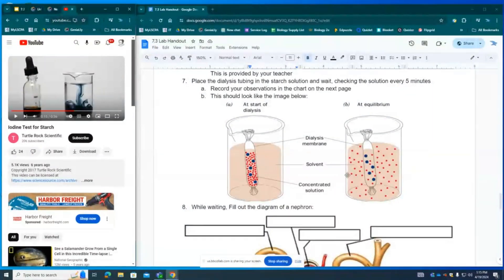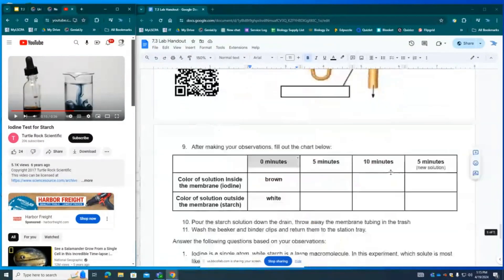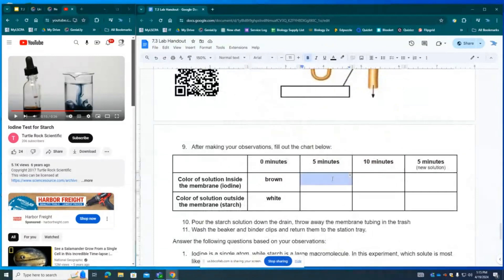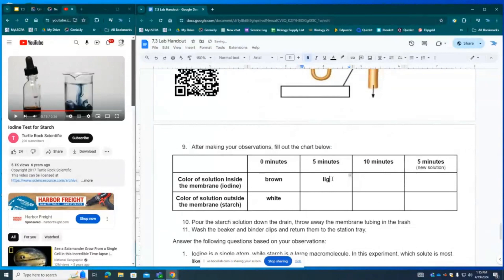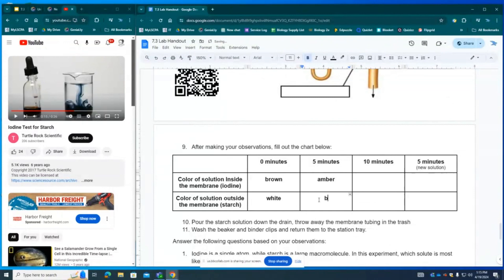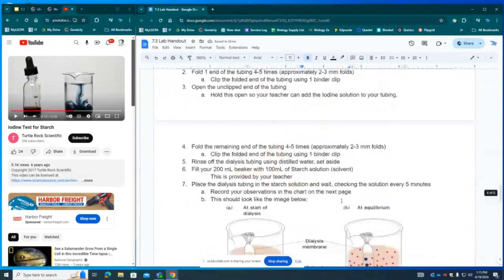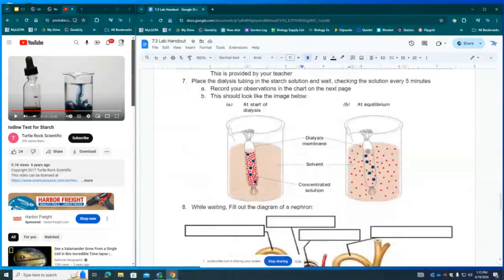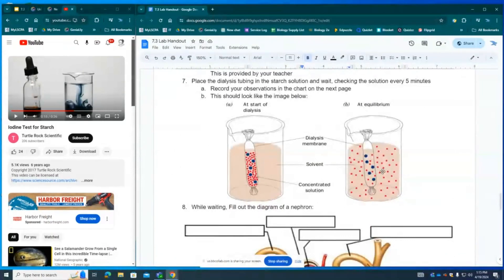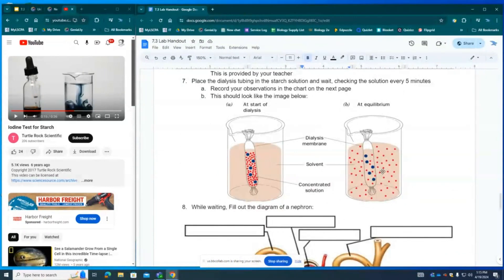So what you'll see in your observations at five minutes is that this should be a light brown or an amber color. We're going to go with amber. But outside is going to be either light blue or blue and streaky. So after five minutes, you should see a strong reaction. This proves that the iodine is leaving the semipermeable membrane just like waste will leave the nephron of the kidney.